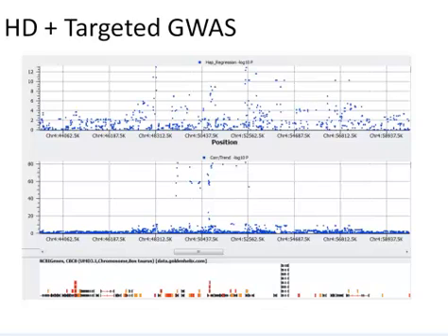But for the GWAS, we had 71 animals, and I used them all. For the stratification, I think, Josh, you can answer this better, but if I recall correctly, yes, it can. Golden Helix can take stratification into effect.